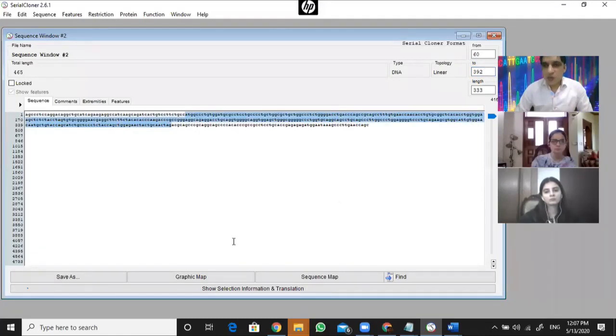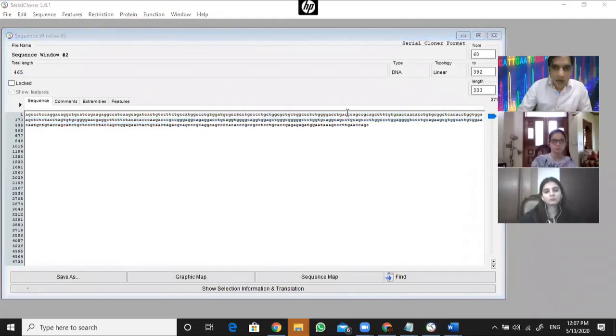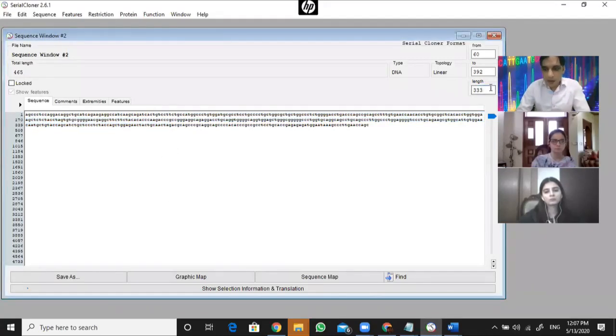So this is the sequence which we can call the consensus cDNA sequence. The software can search for us. It starts from where? You can see. Oh my God, I clicked on the entrance and I have lost it. I cannot click on anything else at that time, otherwise the information is gone.